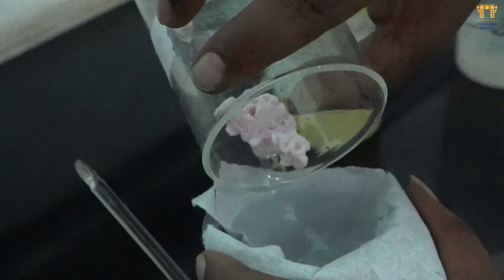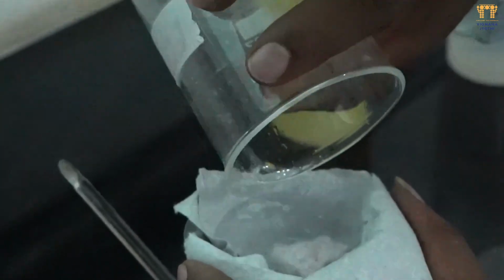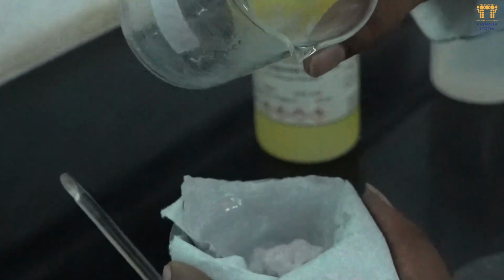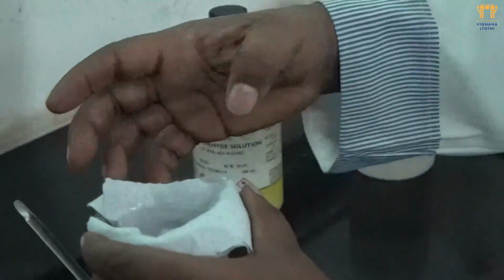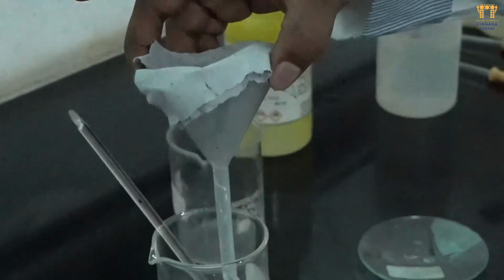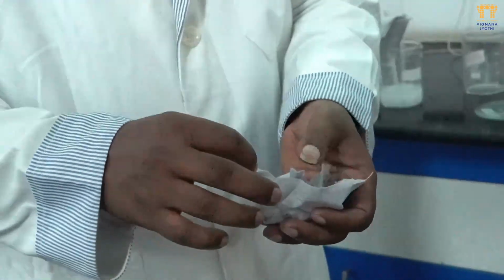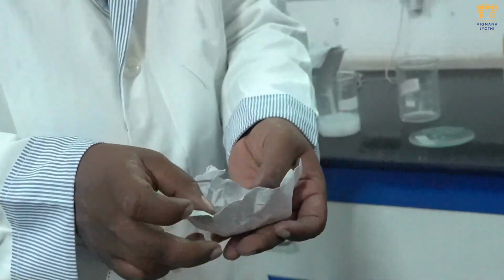Then this product will be filtered off to remove the acid solutions and then dried properly.